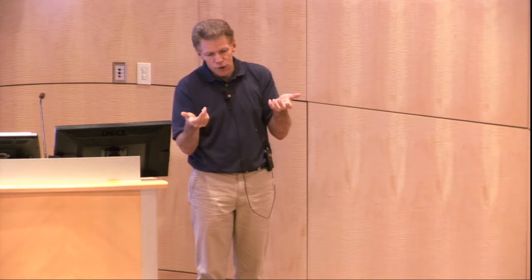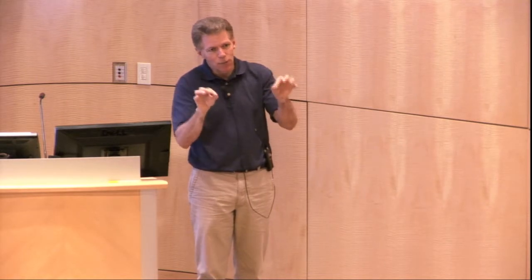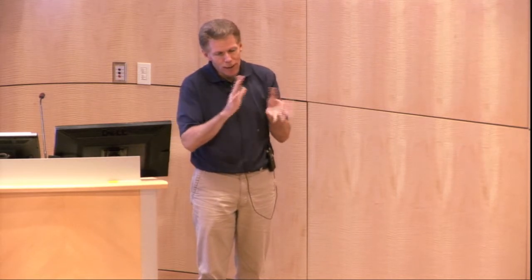And the other thing is that Genome STRiP uses a lot of read pair information. If the deletion breakpoints are in the intronic regions and outside your capture, all you have left to look at is depth. Now you might catch some deletions where the breakpoints happen to land in your capture targets, but that would be pretty unlikely. So in general, it's not a particularly efficient tool, and because you can't normalize that read depth terribly well, we just don't try to call on exome data. So a tool like XHMM is a lot better for exome data.